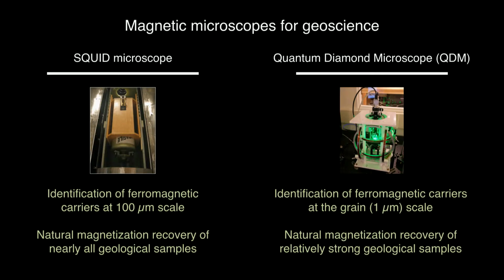How do you set up AF for, say, your ARM experiments? Is it in line with the probe? No, it's not. You have to take it off and put it in a coil. We're thinking about it. I'm wondering, because having everything in line would be more efficient, but then you would require more shielding to keep stray AF fields from hitting your sample when you're supposed to be in a zero magnetic field.